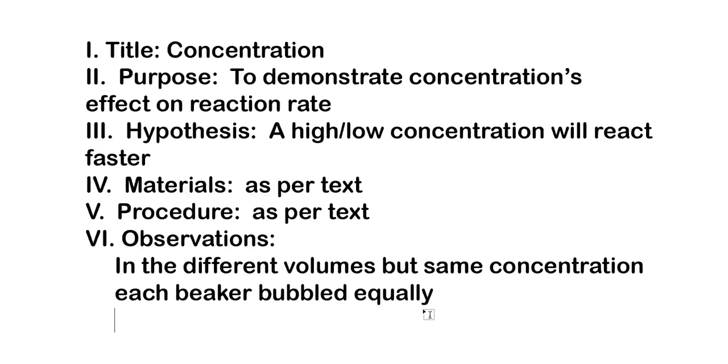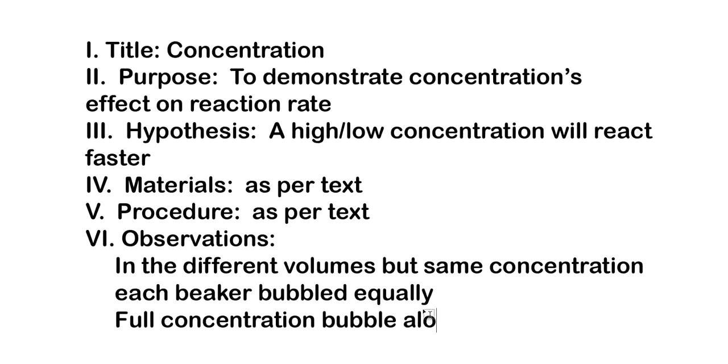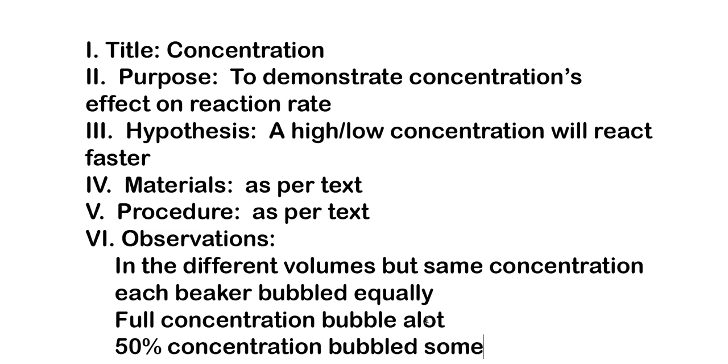So, full concentration, bubbled a lot, 50% concentration, bubbled some.